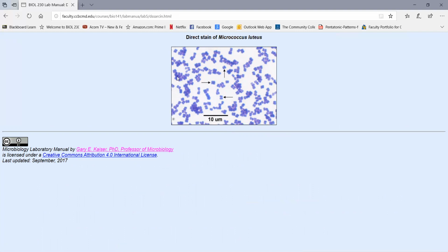So again, don't get confused and call this a staphylococcus when you look at it. If it was a staphylococcus, in fact, it would be named staphylococcus. This is micrococcus. That's a clump. Remember, every slide has clumps. You have to look at where the bacteria are isolated, and here you see lots of nice little groups of 4, and even the clumps are made up of groups of 4. So that would be a coccus with a tetrad or sarcina arrangement you'll be looking for.